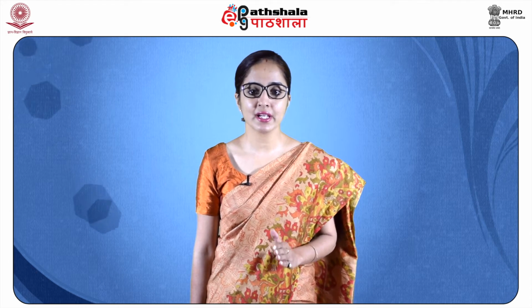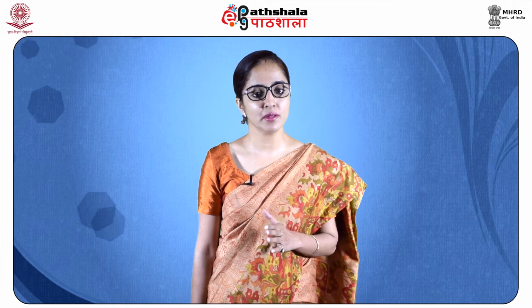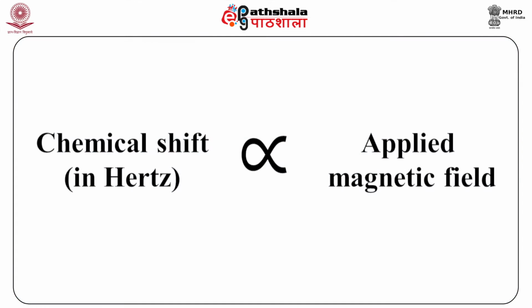There are some important methods to simplify an NMR spectrum and get the maximum information, in order to simplify the spectra and also to elucidate the compound in a better way. Let us now come to the main topic, which is high field strength, one of the ways to simplify the spectra. As we know, students, the chemical shift measured in Hertz is directly proportional to the applied magnetic field, whereas the coupling constant remains the same.